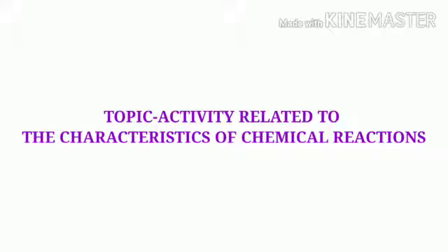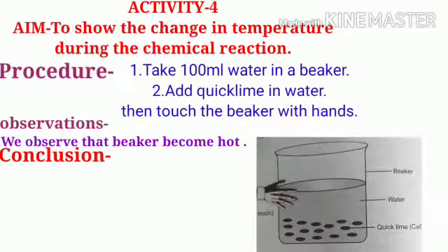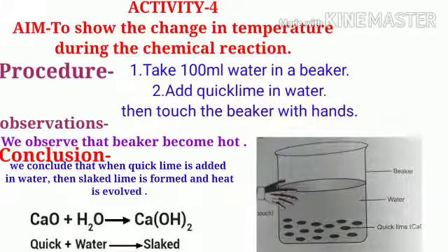Students, in this activity we learn that during a chemical reaction, temperature also changes due to the evolution of heat. The aim of this activity is to show the change in temperature during a chemical reaction.